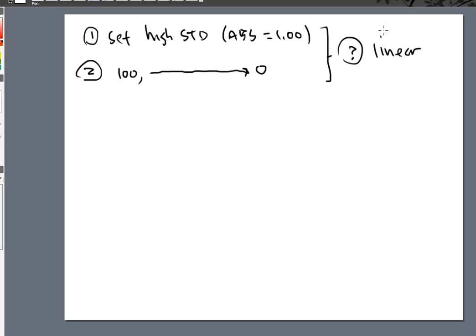So what will happen is that I will plot these concentrations, and I will use the absorbances from the machine, and I will put that into an Excel spreadsheet so that way it can graph it for me. I want to see, is that linear? Yes or no? I don't know if it is or not.